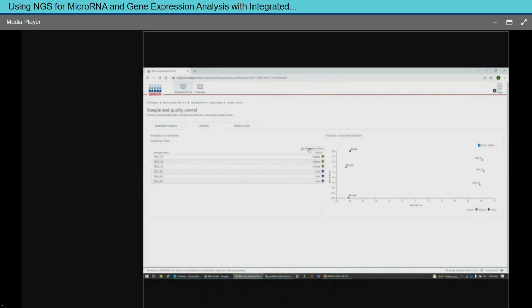From here, I can actually download the microRNA values or the isomiR counts. With our mapping that we use, one of the things that I really didn't talk about too much, which is more of a technical thing, is that when we ligate those adapters on, the ligated adapters have a fixed sequence. The reason why we use a fixed sequence is because this allows us to know what is there, and we can identify isomiRs on both ends of the microRNAs. So these are small base differences within the microRNA family that we're looking at.